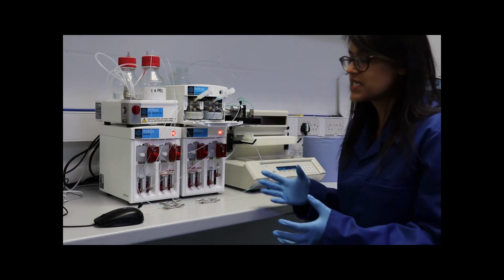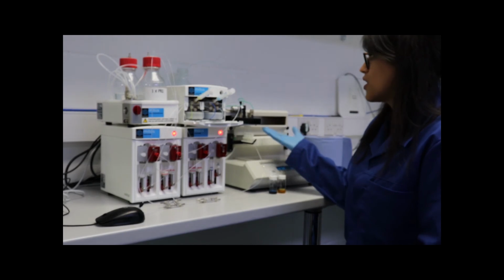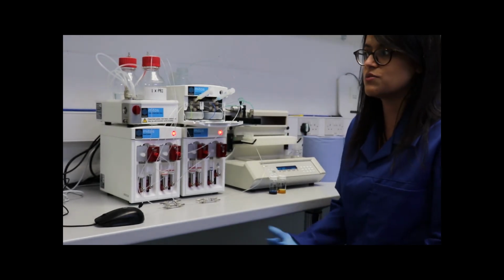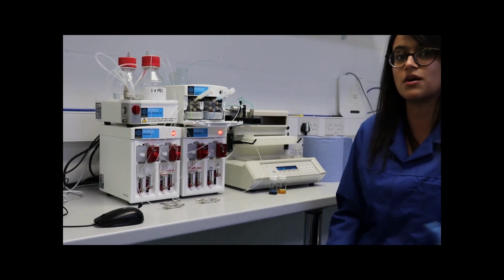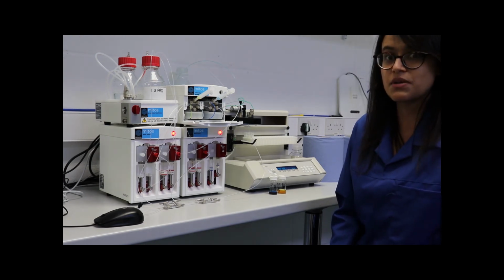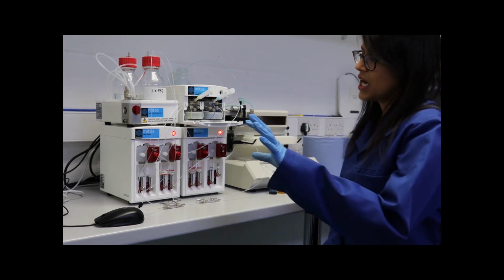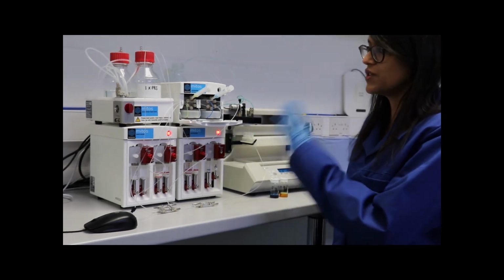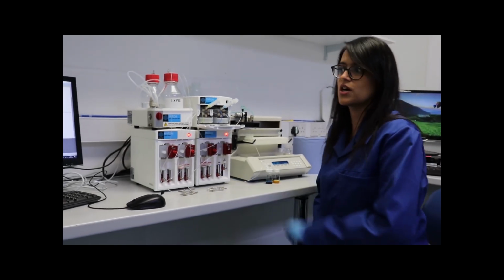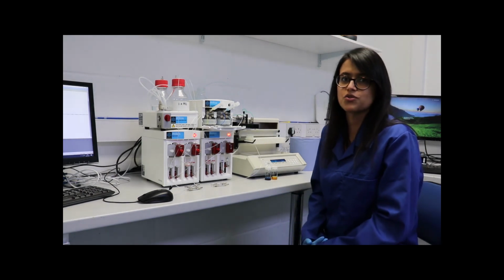We will carry on doing this until it's finished with all the 4 different experiments, and you are ready to analyze them downstream using a DLS or whatever UV vis, for example, that you may be using. So it's literally as simple as that. And once all of your experiments have finished, the whole system will be washed, including the sample loops, and it will remain ready for your next set of protocols, for example.